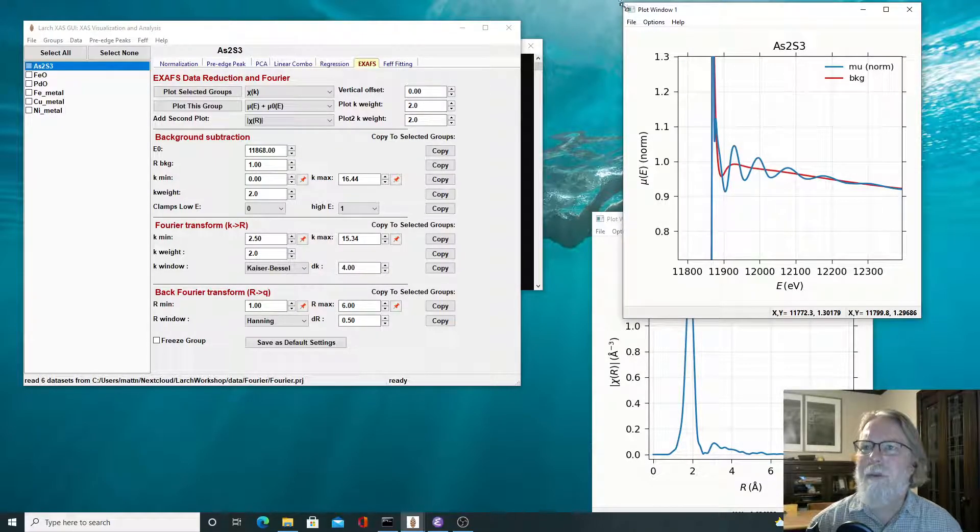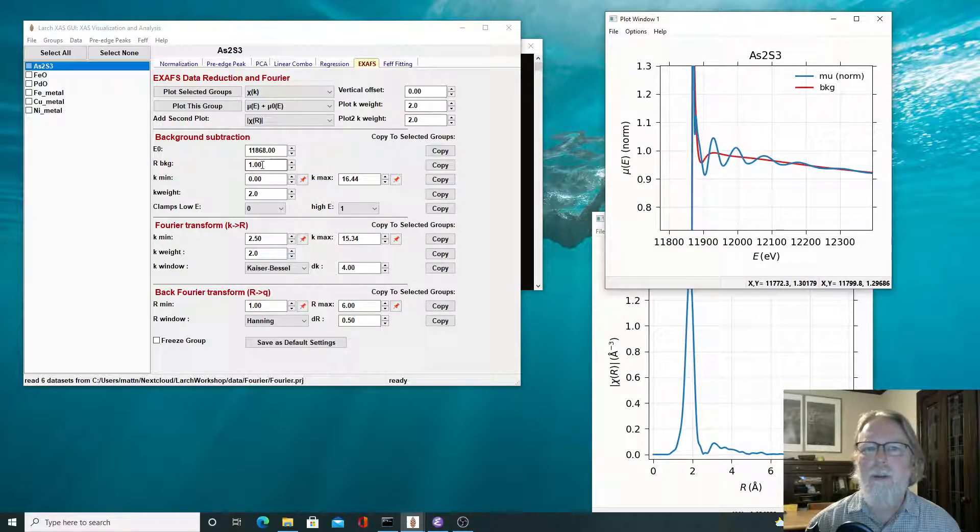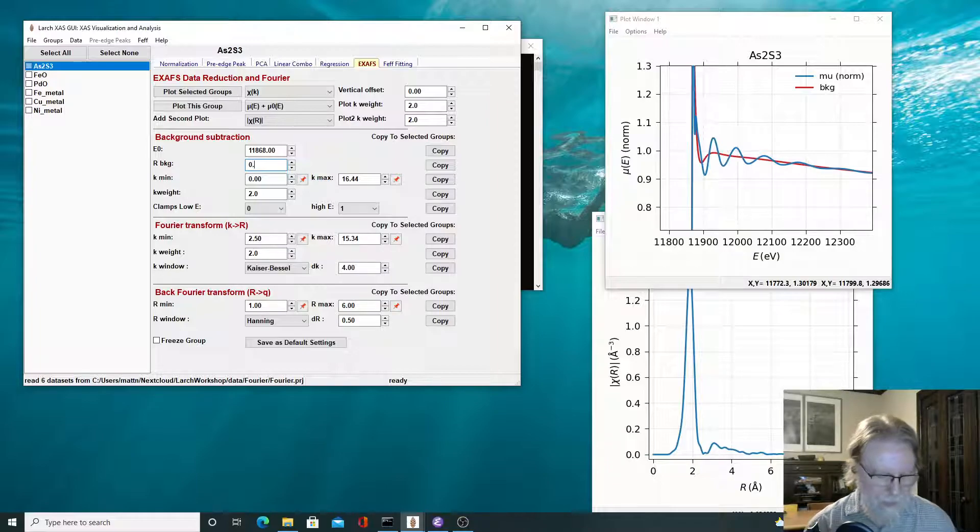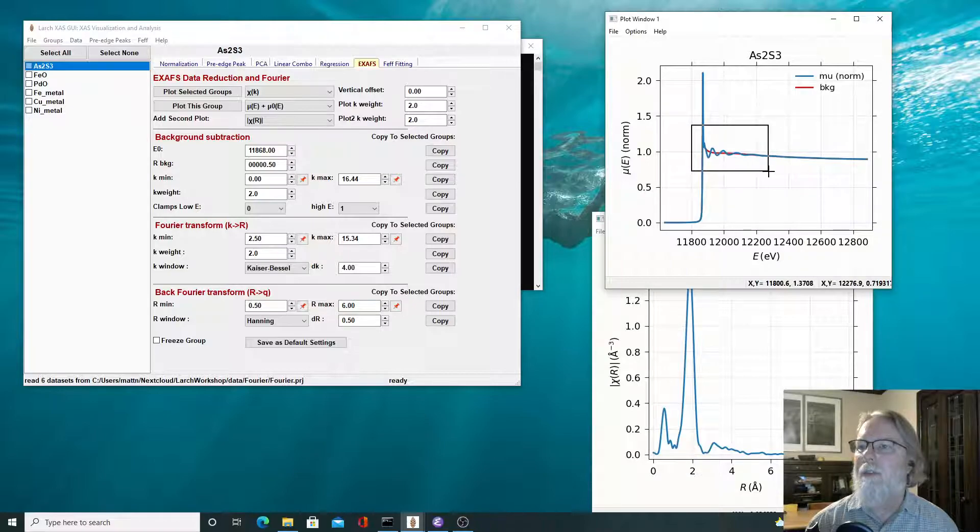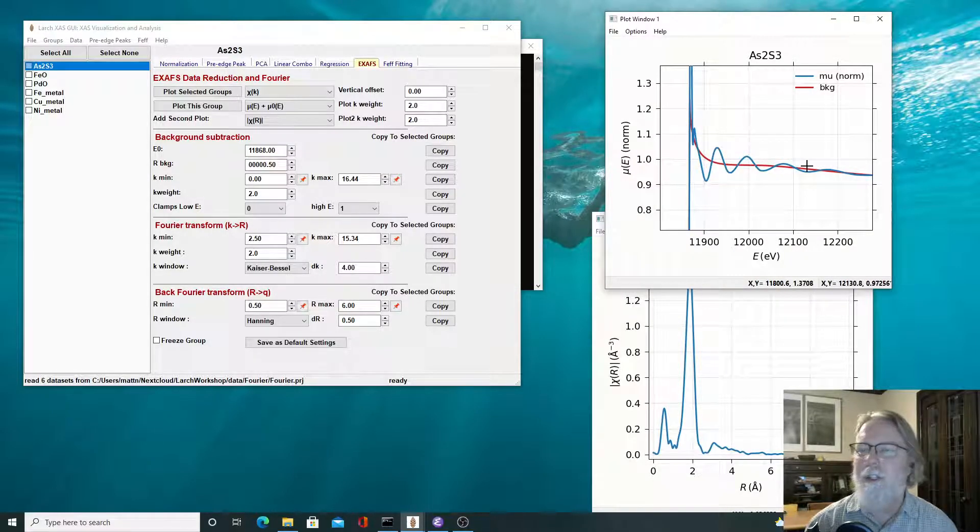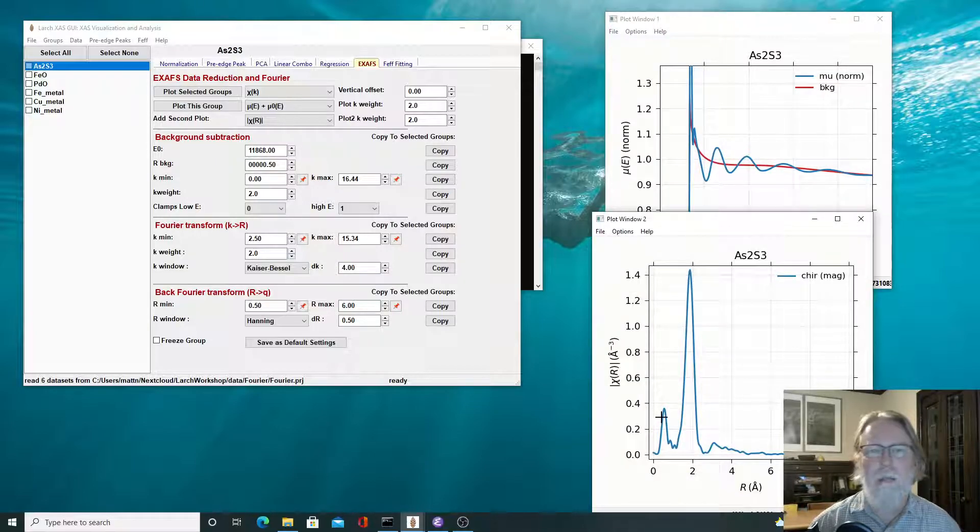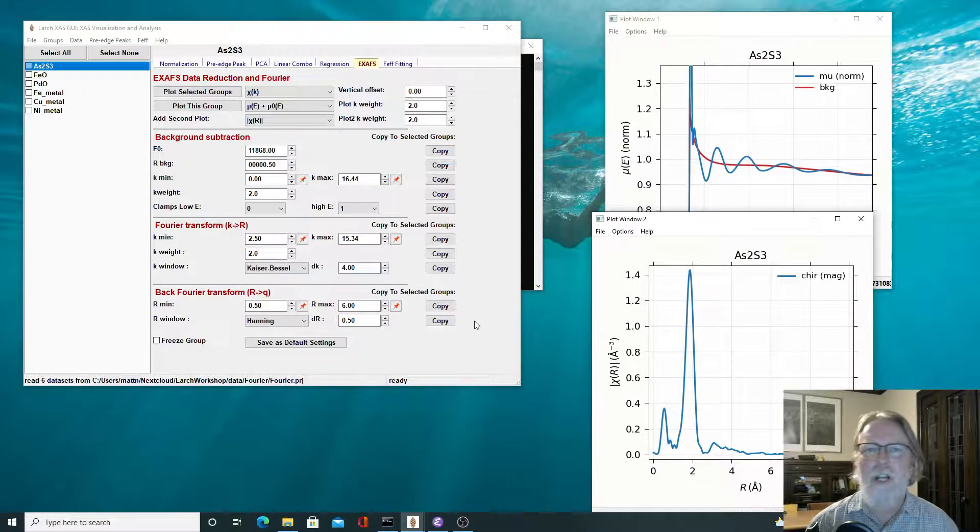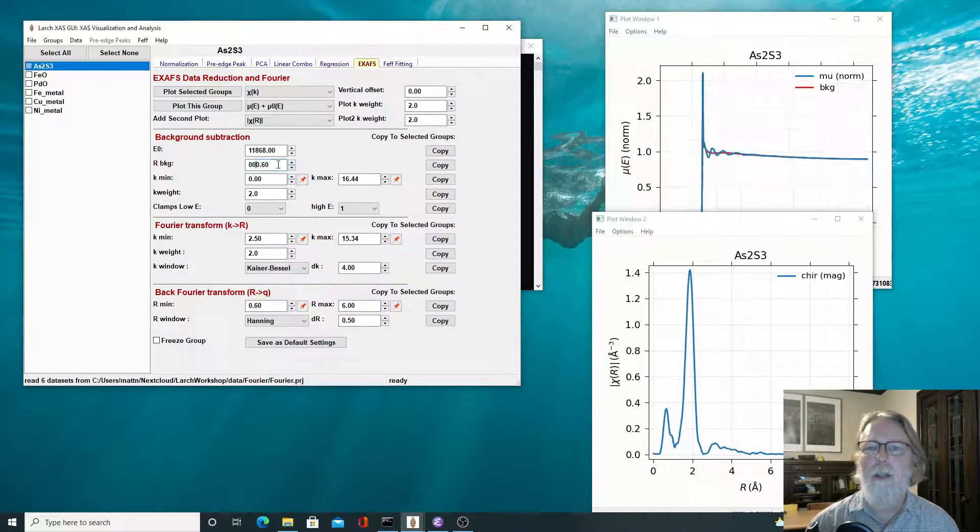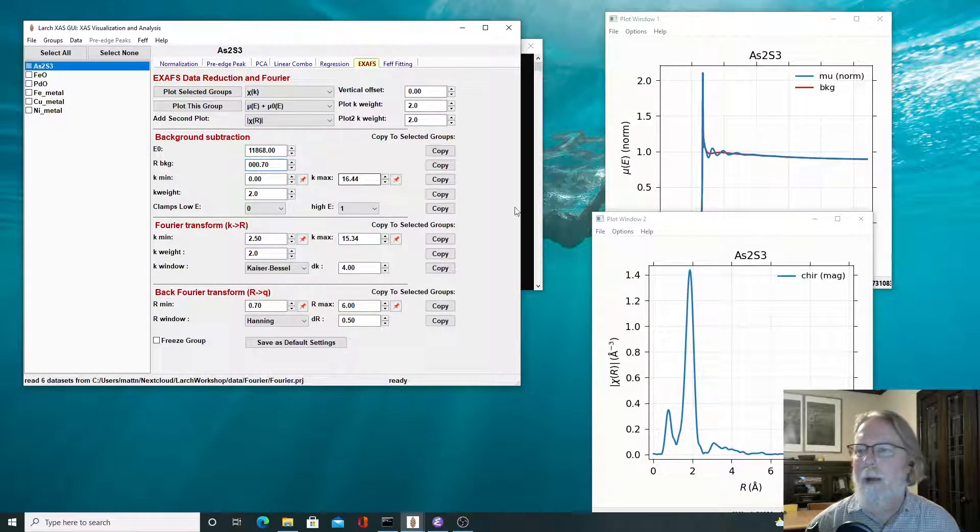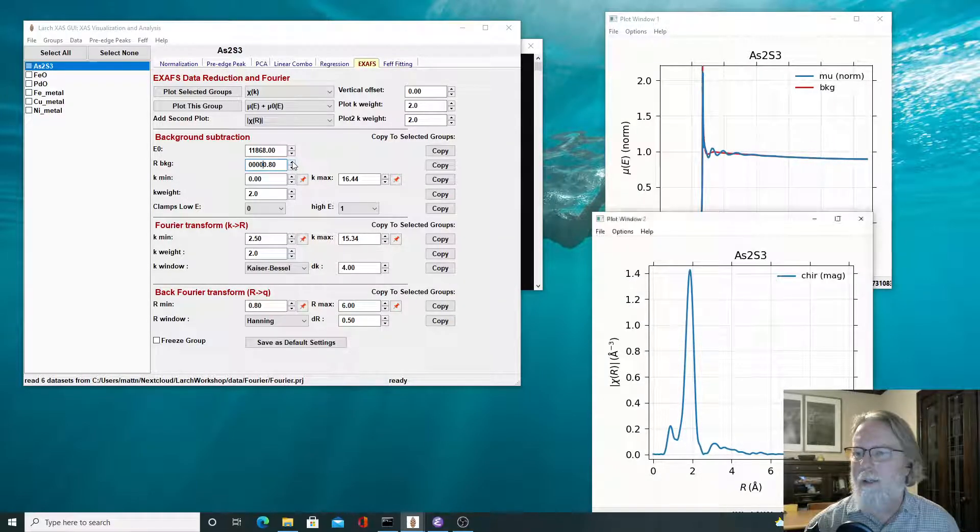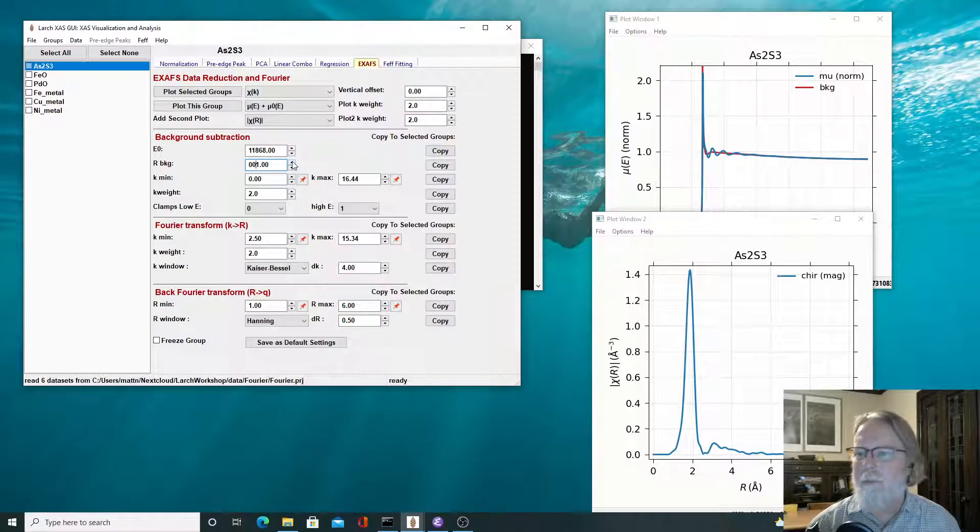So let's play with some of these parameters then. If I just change this RBKG to a much smaller number, let's try a half of an angstrom, then you can see that here the mu is a smoother function. It's tighter, it's more tightly constrained. And here in the Fourier transform, a little peak showed up at about a half an angstrom. In fact, it's the rest of the spectrum didn't change that much. And you might even argue that, well, that probably means that it's okay to have not done a perfect job of background subtraction.